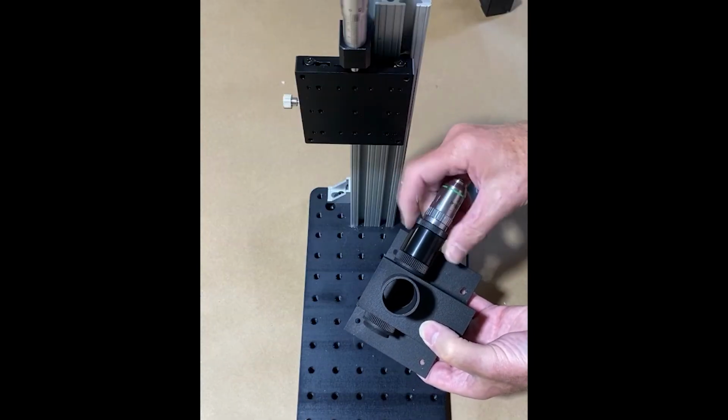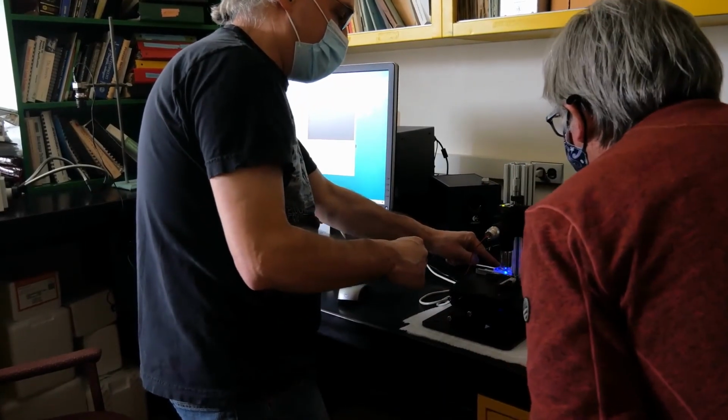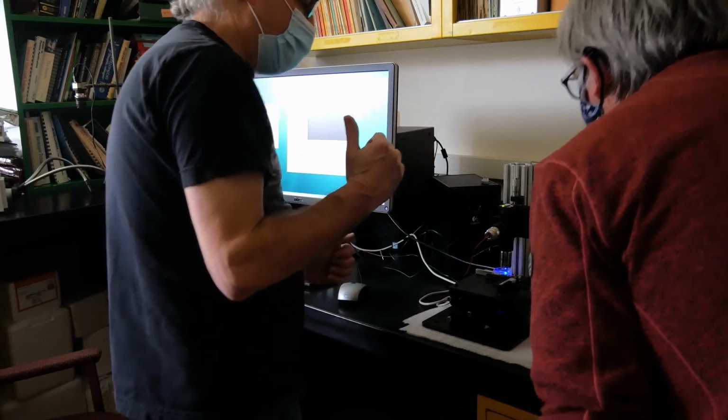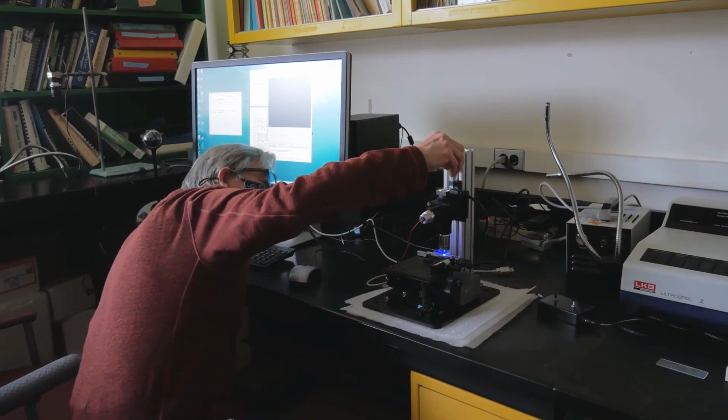When we first started out, we were thinking about primarily using Raspberry Pi devices as little computers with the Raspberry Pi cameras. We were hoping to use that as our camera system and develop it into an epifluorescence microscope to keep costs down. Pretty early on, we realized that the Raspberry Pi camera just didn't have the optics that we needed to capture the images at the speeds that we needed. Switching gears early on really improved the design, but I also think it made the scope and the research a lot more feasible. At each step, we had some hurdles and weren't exactly sure how we were going to solve them, but we all worked together, and Jim would come up with another version of the scope.